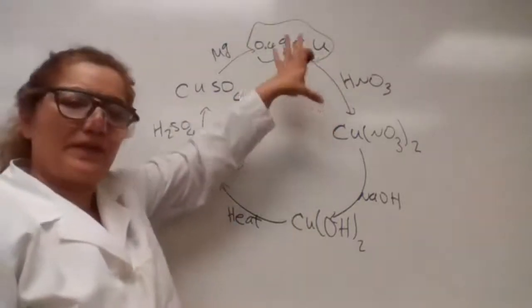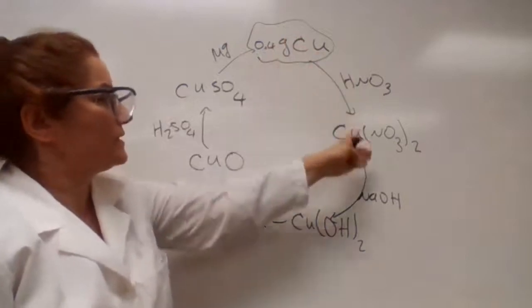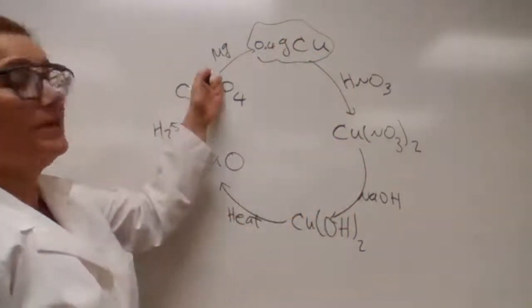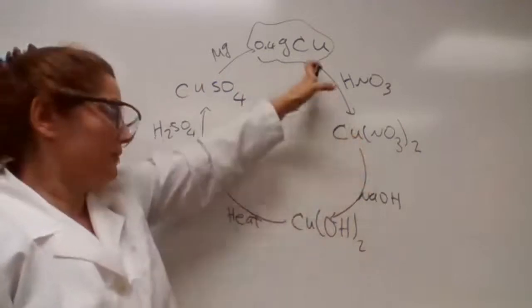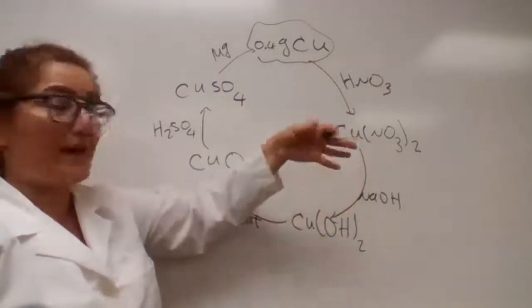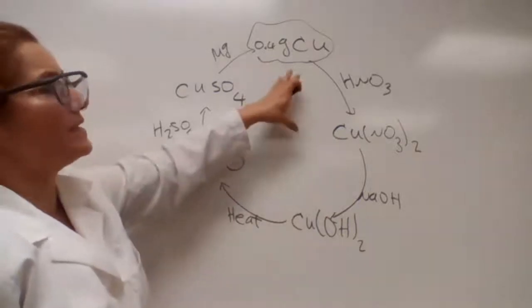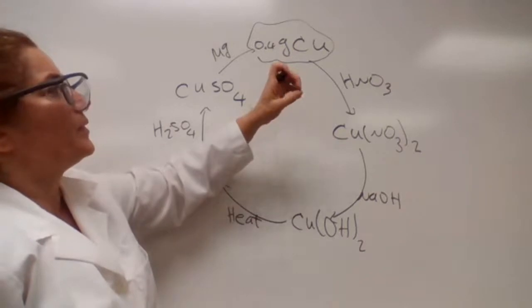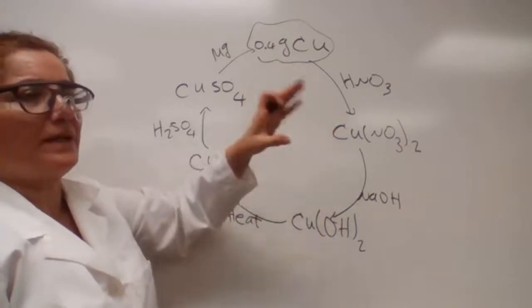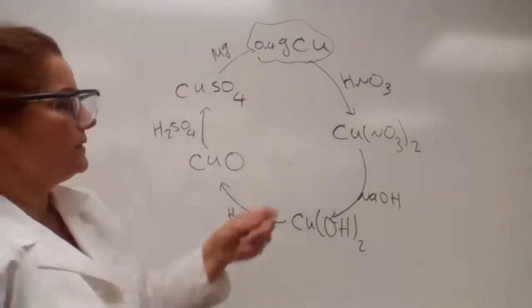What is the purpose of the experiment today? By cycling copper through this different set of reactions, we are going to learn about chemical reactions, what type of chemical reactions. In your data sheet, each part of the experiment asks a question to copy the chemical reaction, but each chemical reaction is explained in the introduction part of the experiment. I'm sure you have read it already.